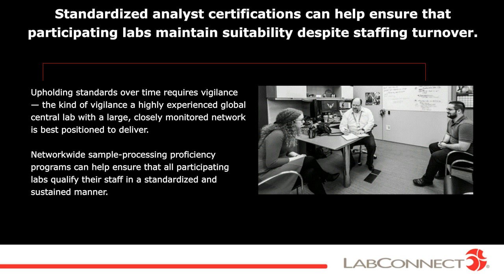And then following training qualification, also having a mechanism to routinely track analyst performance is essential. And we'll take a look at that in our next slide with performance monitoring.